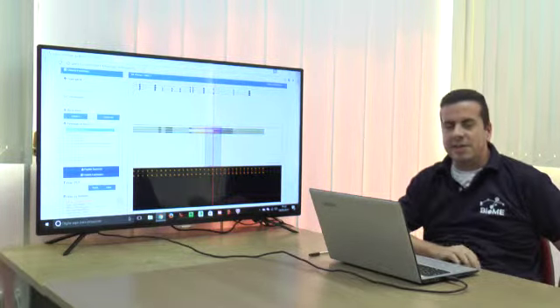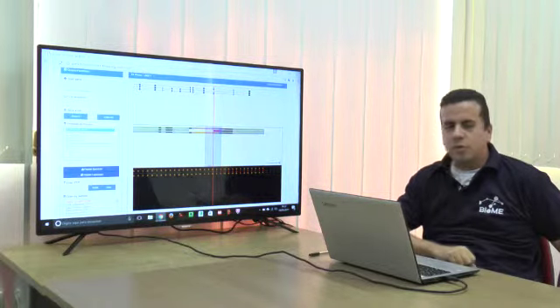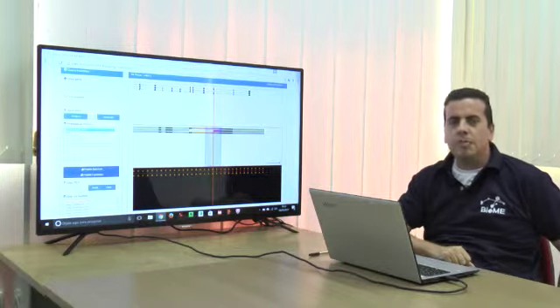I'm a professor here at the Brain Institute and the Bioinformatics Multidisciplinary Environment at the Federal University in Natal, Brazil. And I'm going to talk to you briefly about a tool that we developed here called Proteogenomics Viewer.